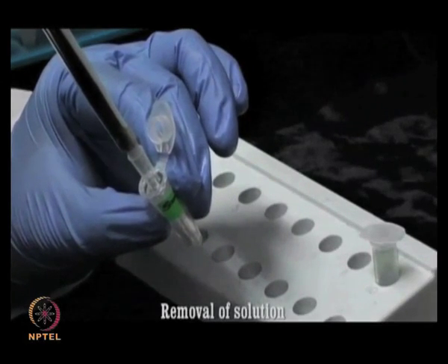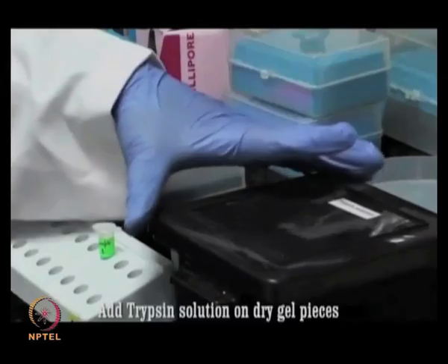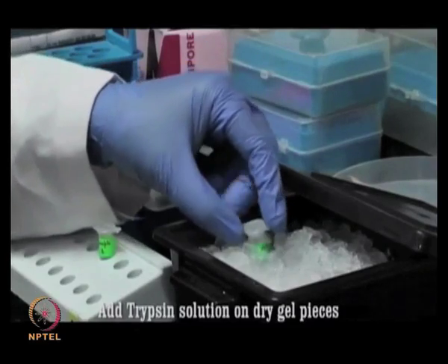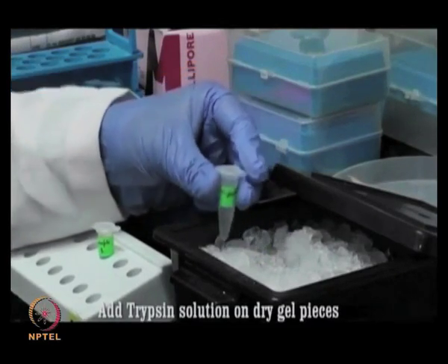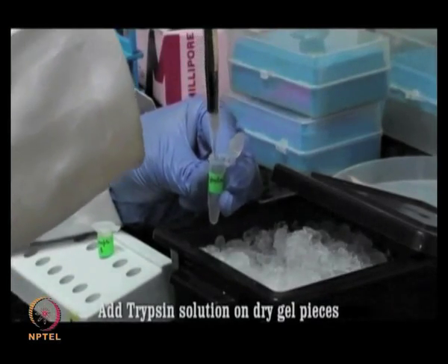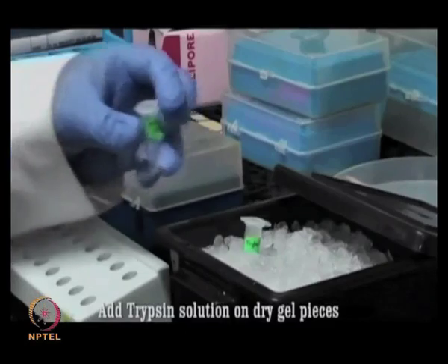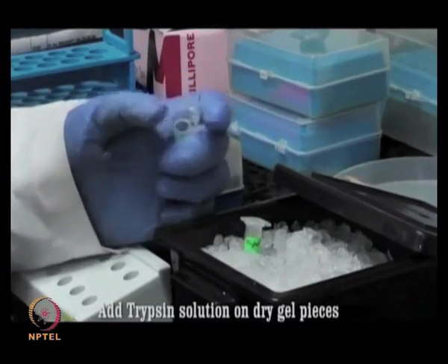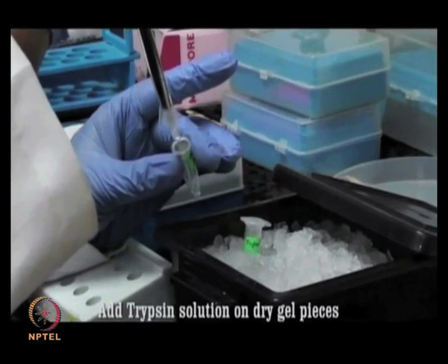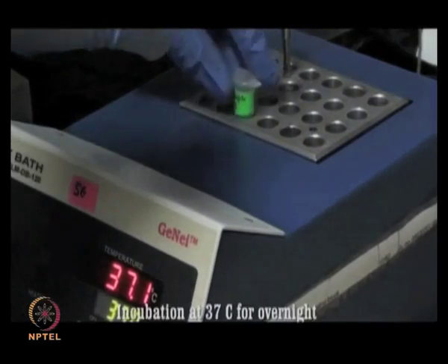Again, you need to remove all the solution, air dry the gel pieces and then add 25 microliter of trypsin solution, around 500 nanogram. So, add trypsin to the dry gel pieces and keep it on ice for 30 minutes for absorption of enzyme by the gel pieces.